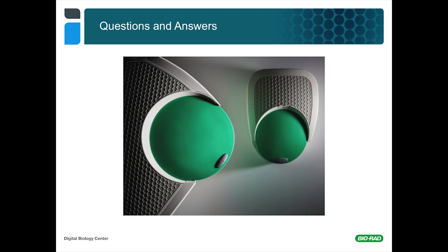Okay, so the next question is moving towards an assay. Can droplet digital PCR be used to evaluate the number of targets with a particular microsatellite repeat within a certain locus?